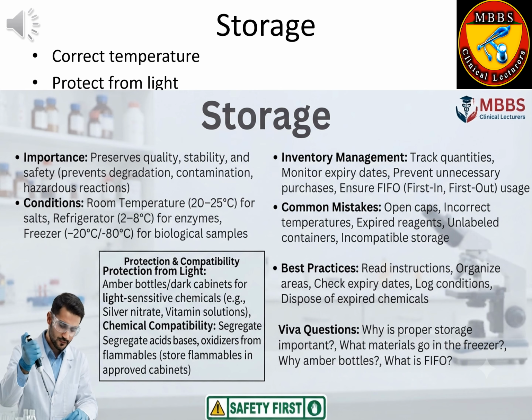Storage. Correct storage of laboratory chemicals, reagents, and prepared solutions is essential for maintaining their quality, stability, and safety. Improper storage can cause chemical degradation, contamination, reduced effectiveness, and hazardous reactions. Storage conditions. Different chemicals require different storage environments.